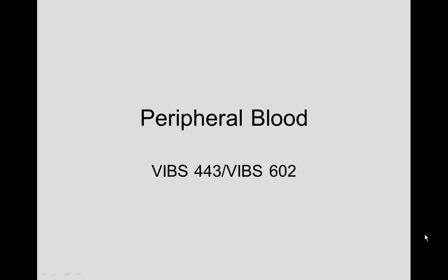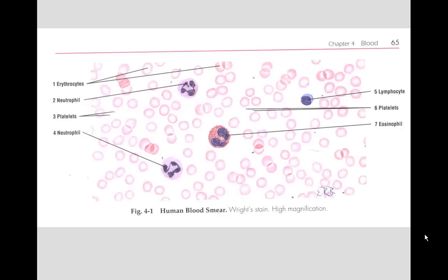In peripheral blood, we can see a smear of human blood as depicted in the atlas. A common cell you see is a neutrophil — there's another one there — with a gray cytoplasm and a lobulated nucleus. The nucleus is in lobes with very dark-staining heterochromatin.